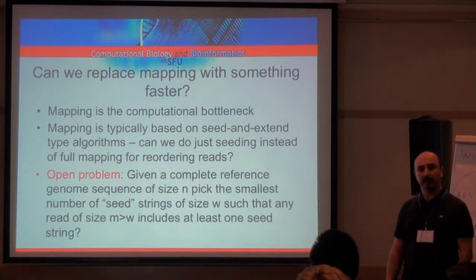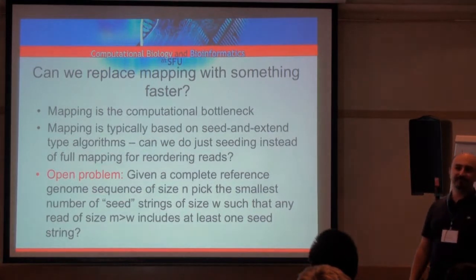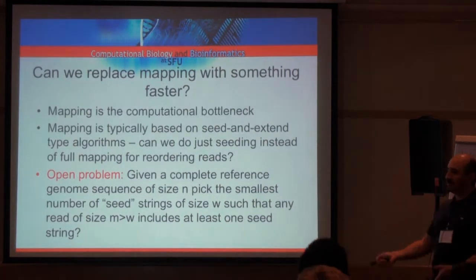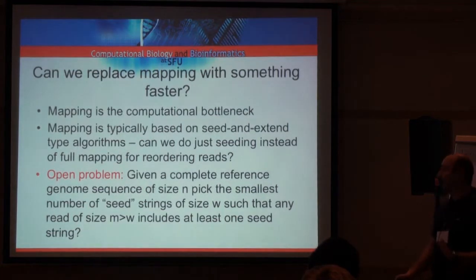I'm sorry? No, I said that the pre-type error is sometimes different. Yeah, that's a bigger issue. In fact, I don't want to do it for the reference genome. I'd like to do it for the donor genome. In fact, just storing the reference genome, processing it, is a hassle.